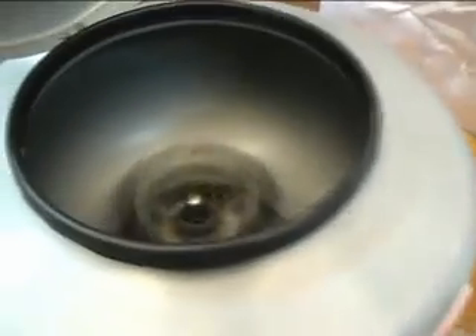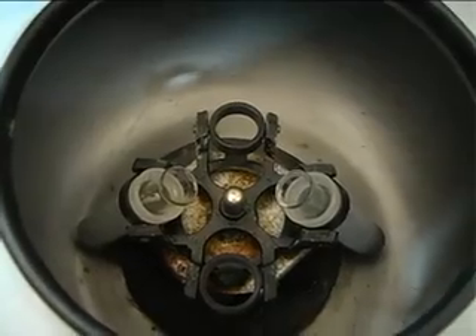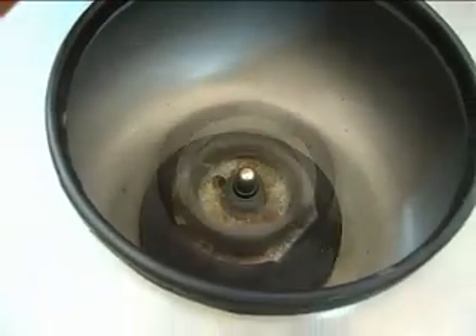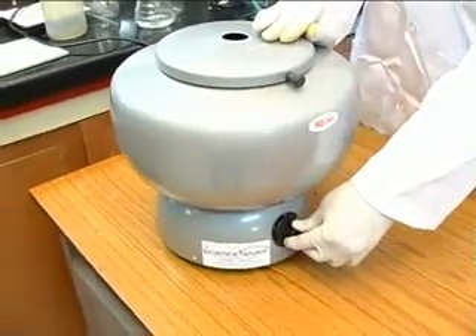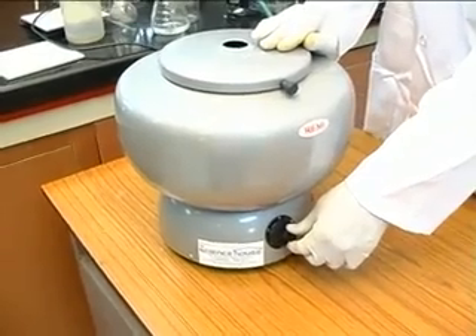The motor rotates at high speeds, causing the particles to be thrown to the bottom of the tube, which remains the farthest point from the center of the disc holder. This is because of the centrifugal forces experienced by particles during rotational motion.